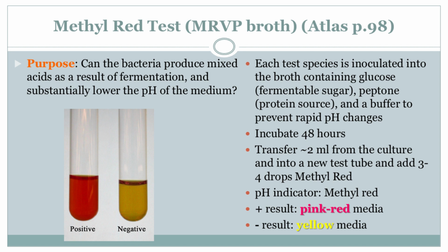Precisely. And this is why the methyl red test is so valuable. It lets us differentiate between types of bacteria based on what their metabolism produces, kind of like how we can tell people apart by their fingerprints. Fascinating.